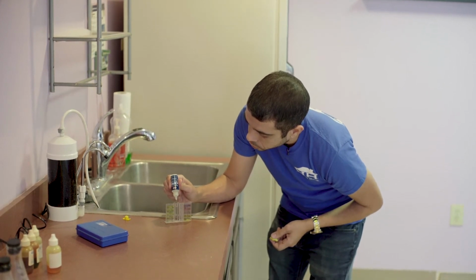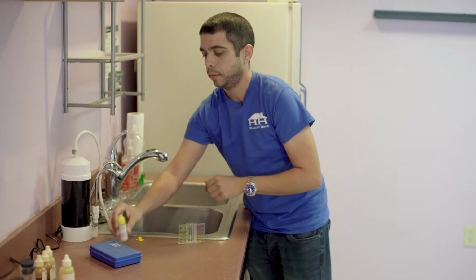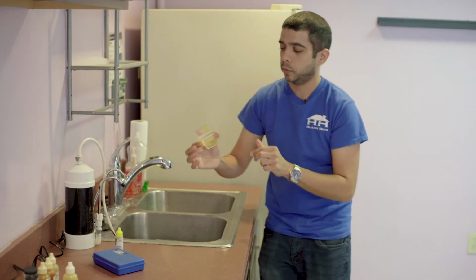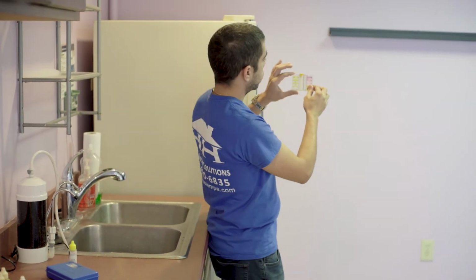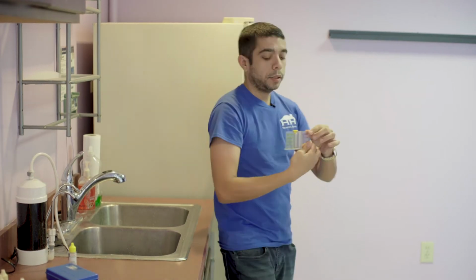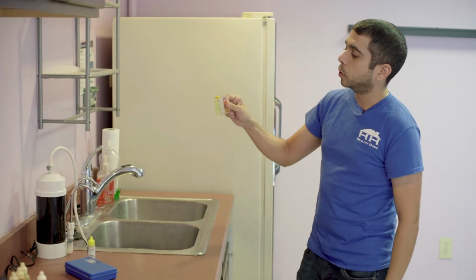1, 2, 3, 4, and 5. All right. Add our little cap here. Give it a little swig. Now, right away, we can start to see a small discoloration as it starts to turn a tint of yellow. In some communities, sometimes it's a little higher, sometimes it's a little lower, but the chlorine is there.